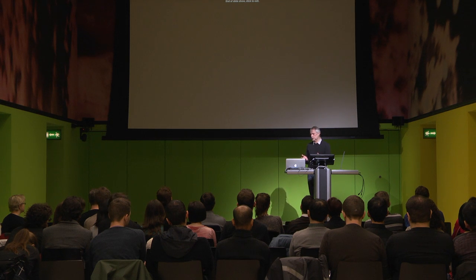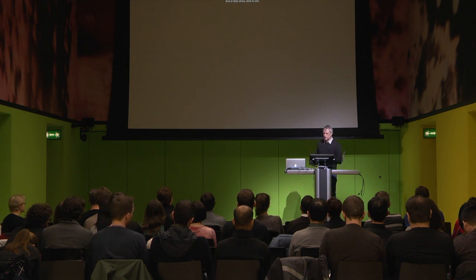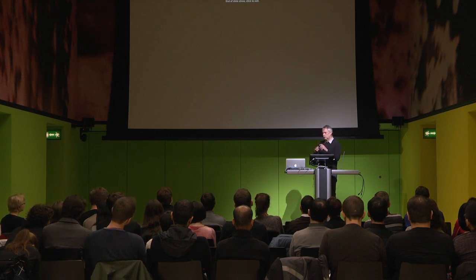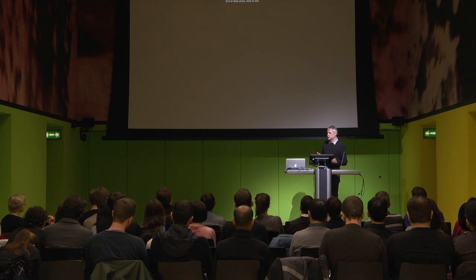So what I would say in response to your question is that if someone is studying a particular biochemical process, for instance metabolism, some signaling pathway, or whatever the case may be, then you generally know what the proteins are. And you can then ask what happens within this confined space using, for instance, techniques like SRM. And you will find new relationships between these proteins in a previously confined space. So this is actually very valuable and should not be dismissed.